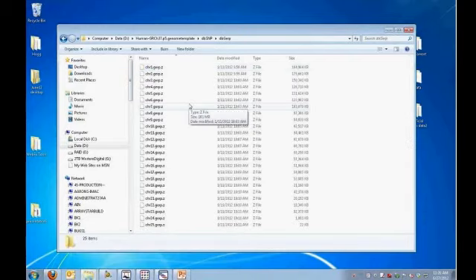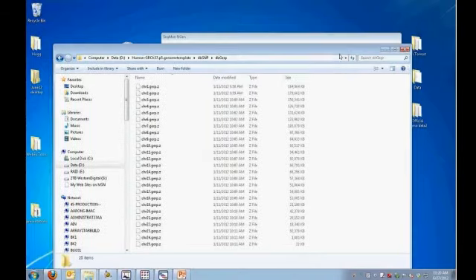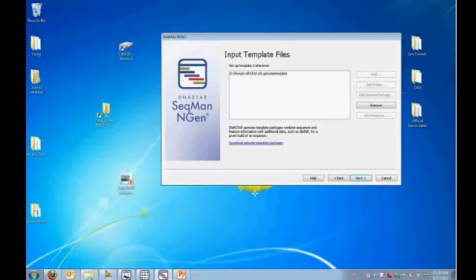This can change. So as new databases become available that have different subsets or variants, we can add them to these genome template packages and build them for you. And so the advantage here, the reason that I want to have dbSNP up front, is that with the very large data sets, when you have hundreds of millions or billions of reads, it's a big advantage to begin the variant analysis as the data is streaming through the assembler on your big computer.